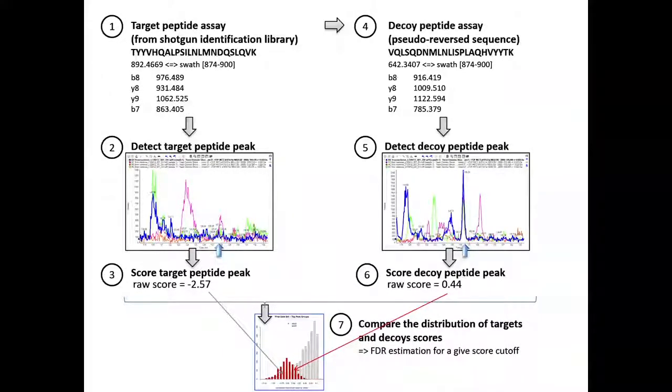Yeah, I'm saying that if you're shuffling or reversing, we're not BLASTing the sequences against our target organism, so surely there is the potential that we could be getting quite real, legitimate peptides. It's the same for DDA data, right? Yeah, it's the same issue.